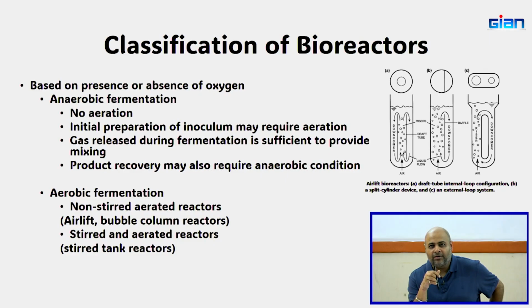I asked you a question about if you have potato peels, or let's say you have orange peel, what sort? So either it would be a submerged bioreactor or a solid state, right? So that's also another classification. So whether you're going to have everything submerged inside or not. Then you have your presence of oxygen or absence of oxygen.